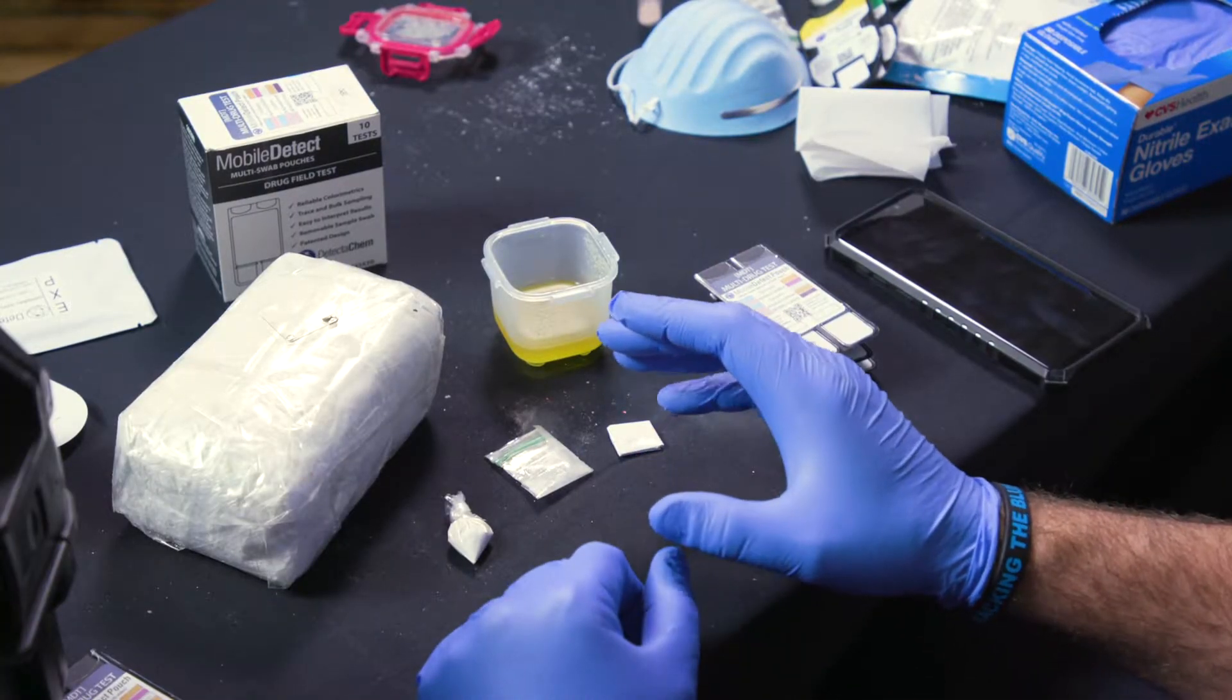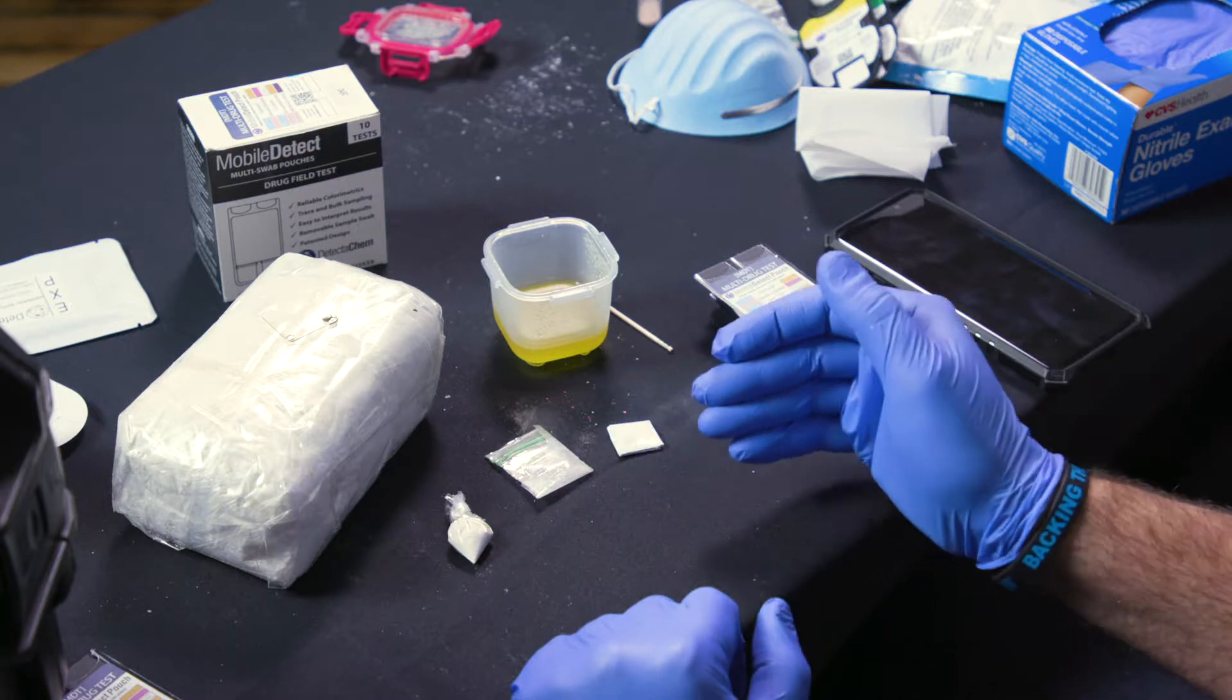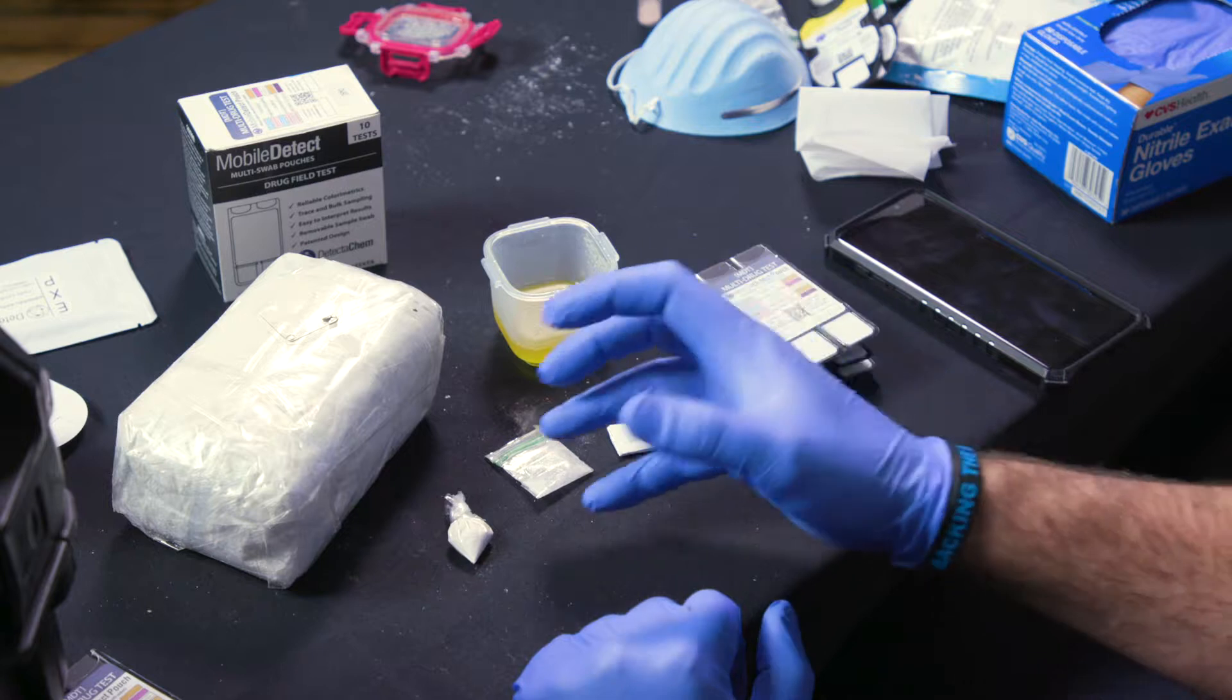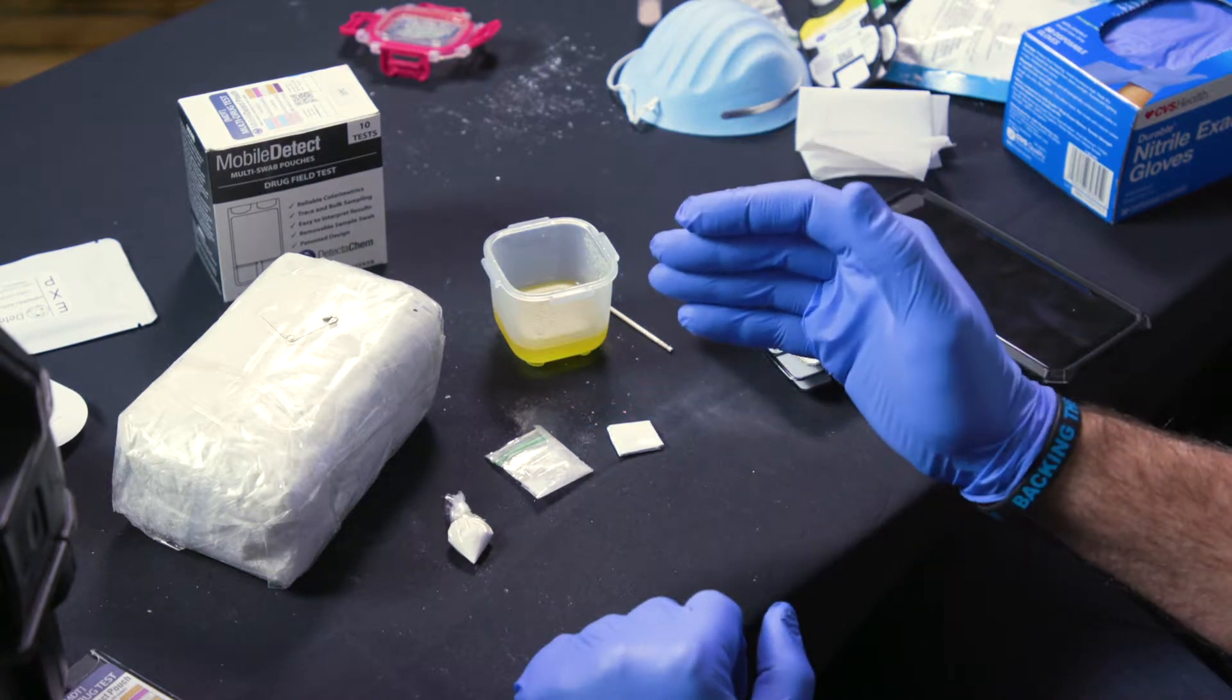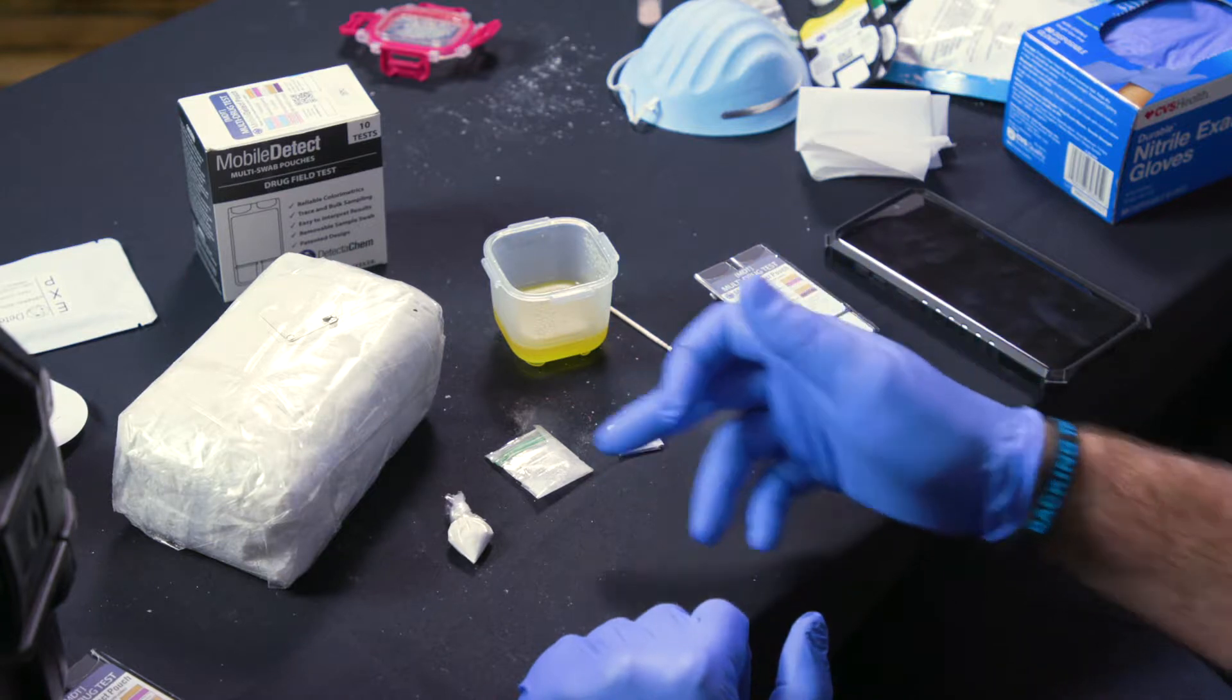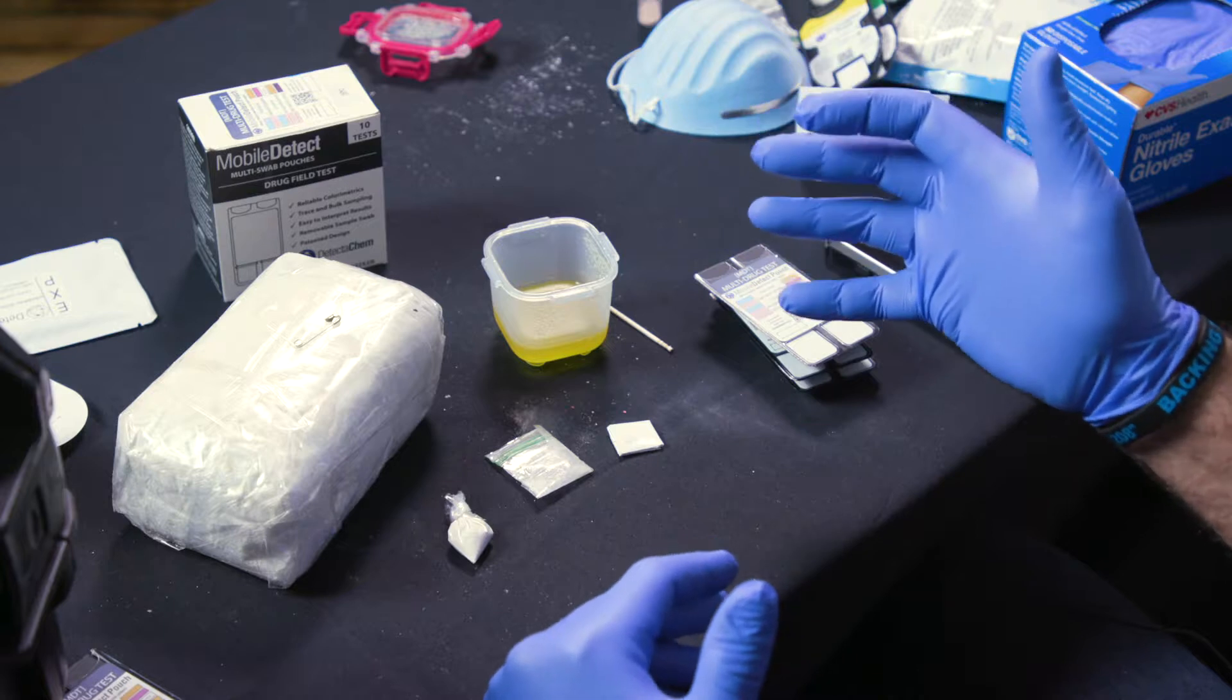I'm here to talk to you about different ways to sample with the least amount of exposure to the suspected drug or narcotic inside the packaging. There's various best practices whether you're doing a corner bag, ziplock, wax paper, kilo, BHO, dab, shatter, whatever it may be.